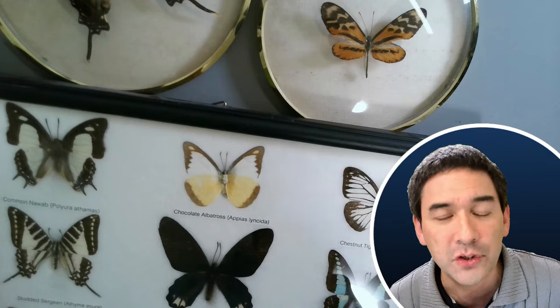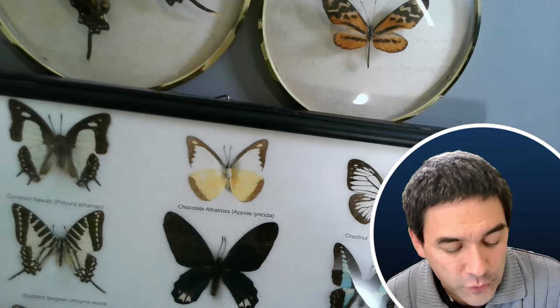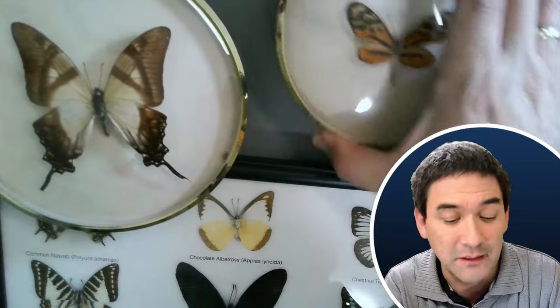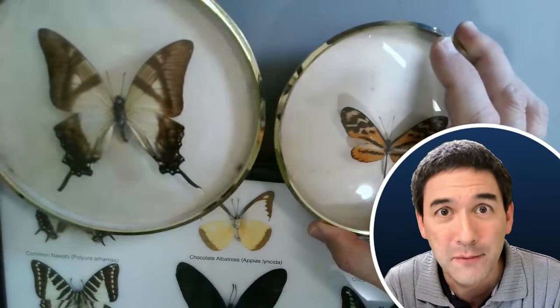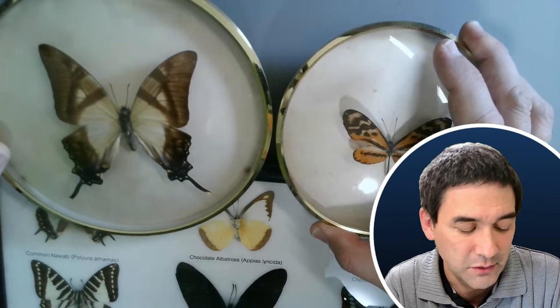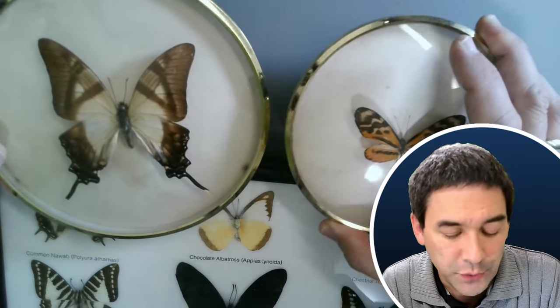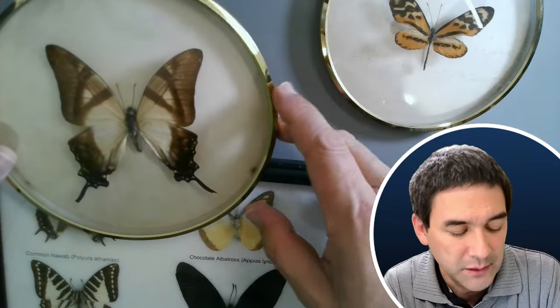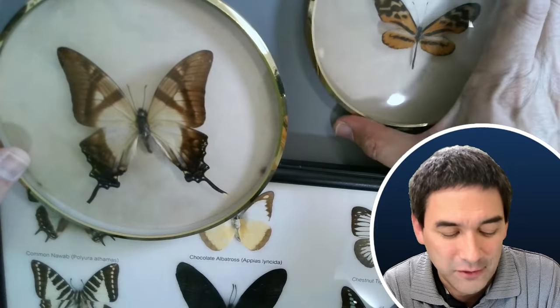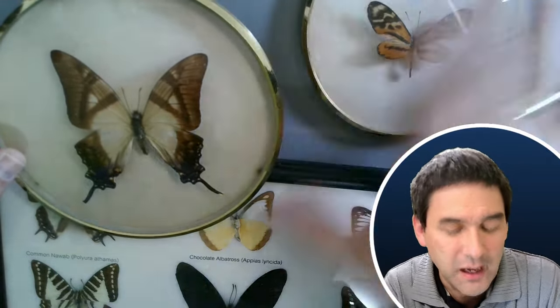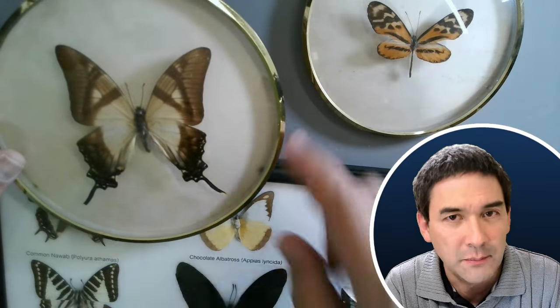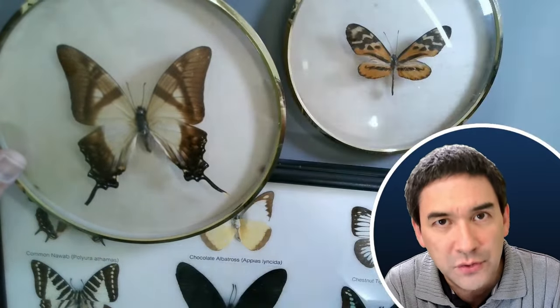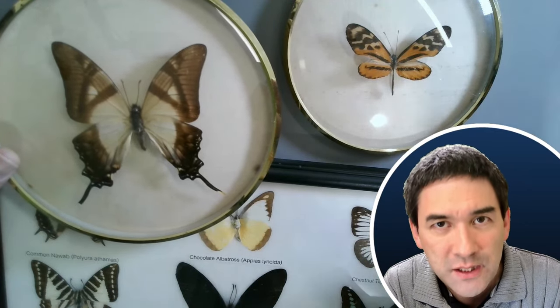Hello around the world. I'll be starting right away. I've got here some prepared butterflies — I did not make them myself. These butterflies have been in the family for maybe 40 or even 50 years. They are quite old. The background paper has already started to get a little dirty. I know about the ethics of killing animals, but I did not prepare those.